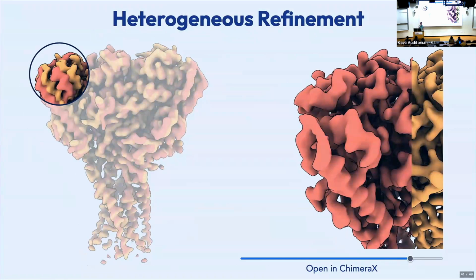We force particles to be spread among the classes evenly according to the class similarity. So if you have two classes, A and B, and your class similarity is set to 0.5, you basically assign half of the particle's density to both classes equally, and then half to the one that it goes to.